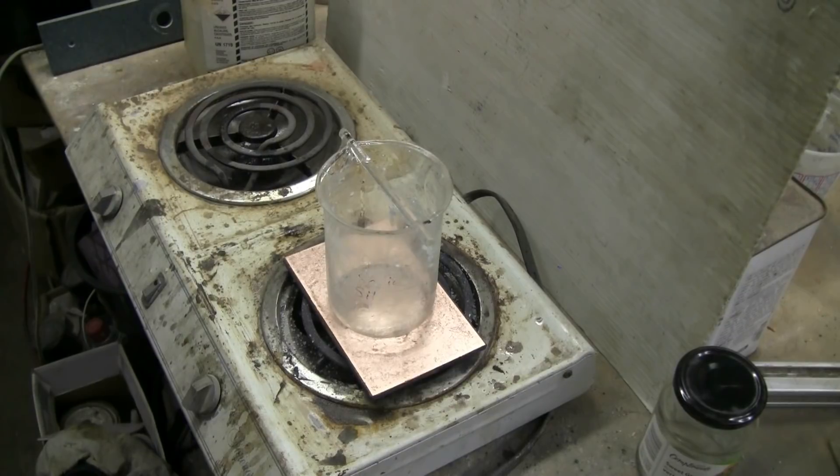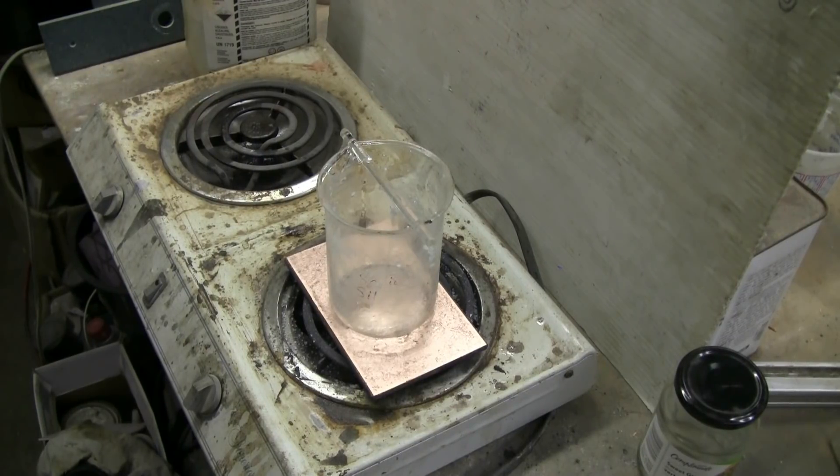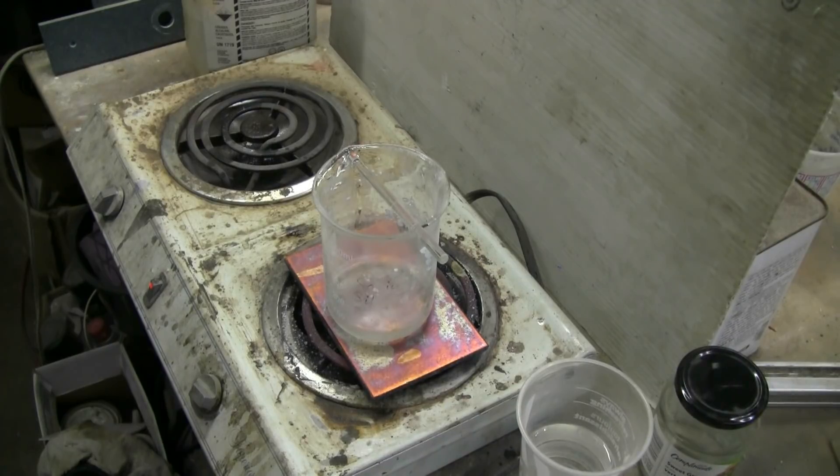I'm going to make the sodium silicate in this 500 milliliter beaker, heated on this old two-burner shop stove. I have a copper plate on top of the burner to spread the heat out so the beaker heats evenly and doesn't overheat. The mixture I use is about 300 grams of silica gel crystals and about 200 grams of sodium hydroxide. I've already warmed up the stove and put 50 milliliters of water in the bottom of the beaker.